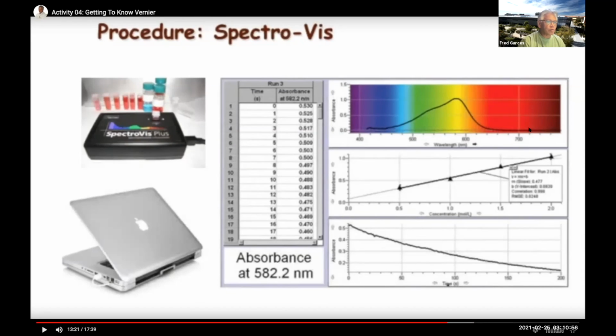It tells you the absorbance at different wavelengths. So this right here is just white light, or for this particular chemical, it basically tells you it's different from a Spec 20. You guys were exposed to the Spec 20, I think in Chem 200. A Spec 20 basically just tells you the absorbance at one wavelength. This particular device tells you the absorbance at different wavelengths, in this particular case from 800 all the way down to 420 nanometers.